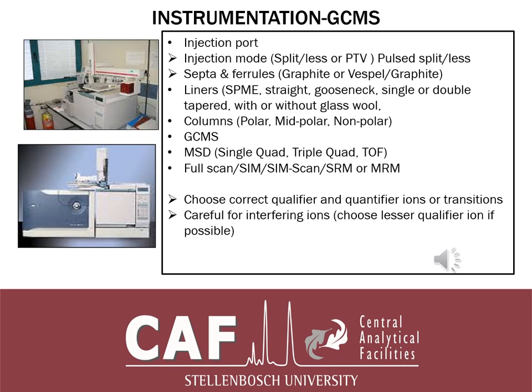For the triple quad, you can do SIM, you can do SRM, you can do full scan, and sometimes you can also operate those instruments in both SIM and scan, so you don't lose the full scan possibility. Because if you only do SIM, you can't do a library search; that's a disadvantage. But if you do full scan, you can do a library search. But if you do full scan, you might find that it affects your sensitivity when you do quantification, especially if you're working at lower concentration. That's why you need single ion monitoring.